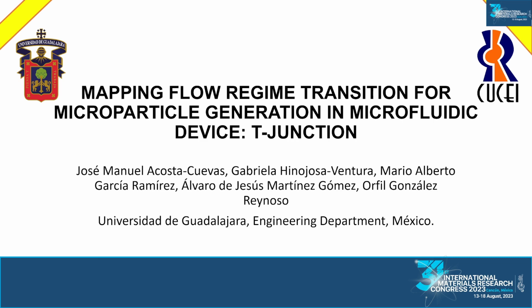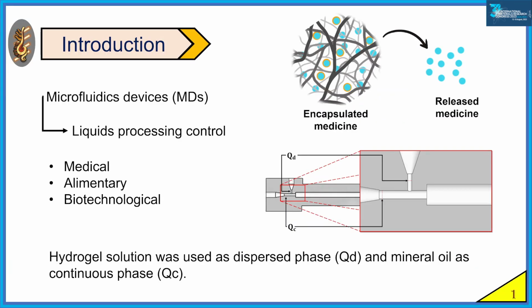I'm a PhD student from Universidad de Guadalajara, and I'm going to talk about mapping flow regimen transition for microparticle generation in microfluid device T-junction. Well, let's start.